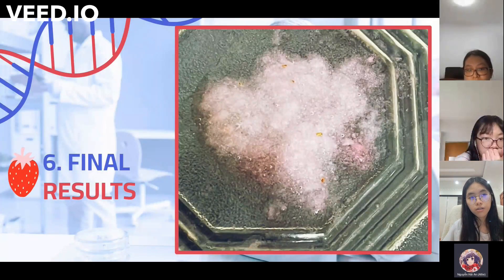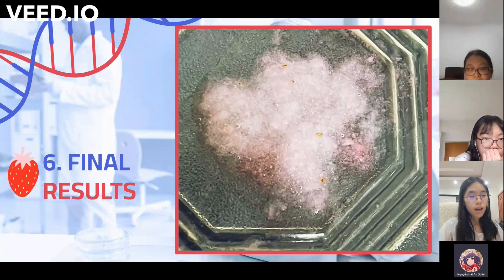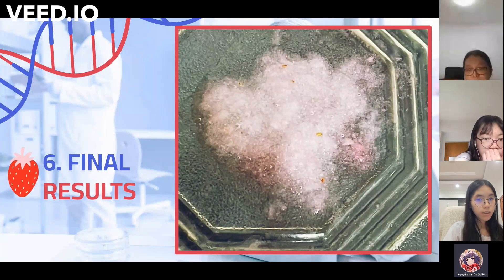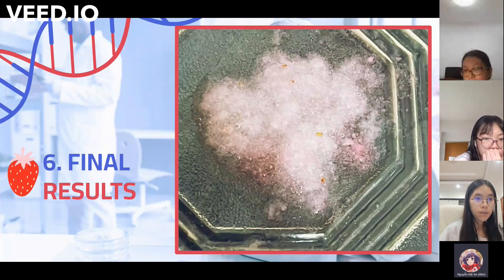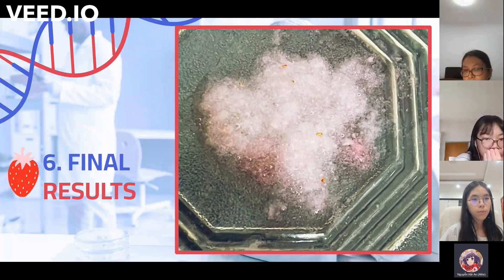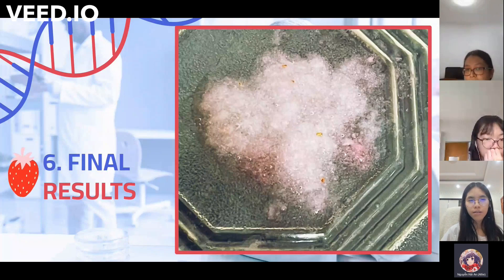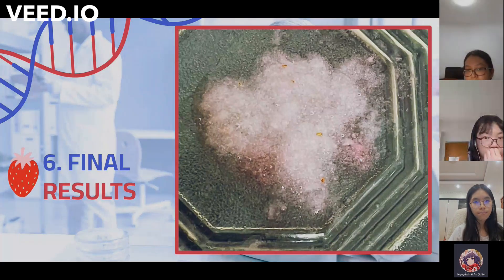The ethanol sat on top of the detergent due to its lighter density, but the bubbles started rising as soon as the ethanol was added and the liquid became cloudy. The DNA grouped rapidly, taking no longer than two to three minutes total before slowing down and seeming to stop grouping. The DNA itself looked like slime and was easily extracted from the mixture and sticky to the touch.